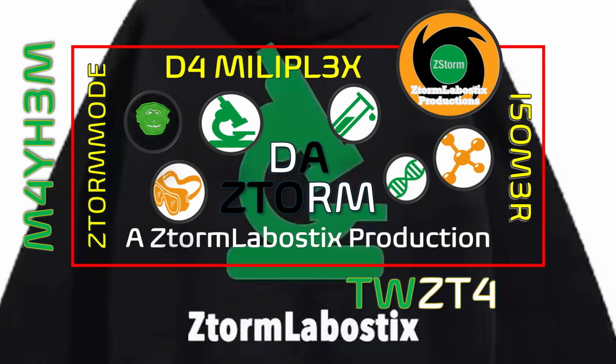Example: the preparation for extracting genomic DNA from human brain tissue is completed through a particular manufacturer's DNA kit, where it can extract anything from 8 to 15 micrograms of DNA from 25 milligrams of brain tissue through three stages known as tissue lysis, DNA extraction, and DNA shearing.